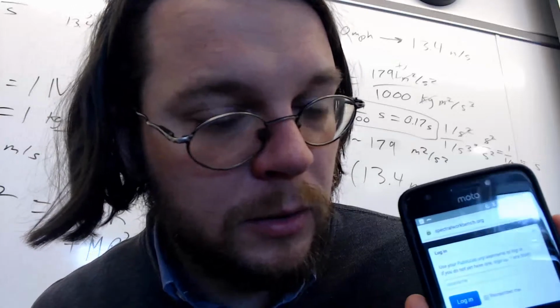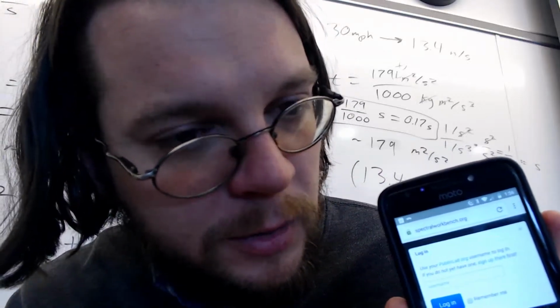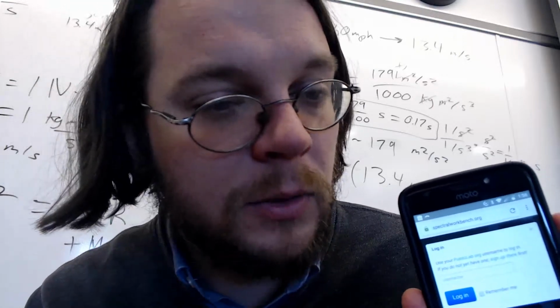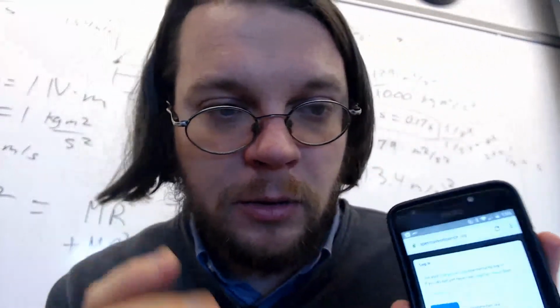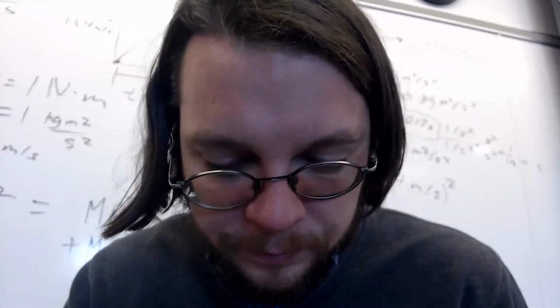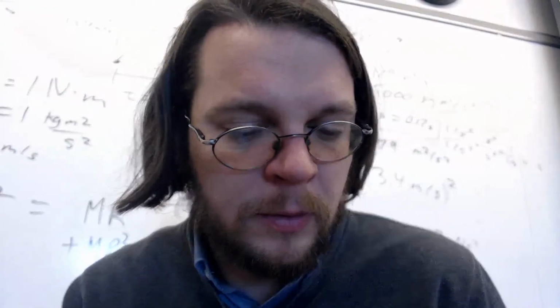So I'm going to go ahead and put in my username. Now the weird thing is that when you put your username in, you press login, it doesn't actually log you in. Instead, it goes to a page where you can actually put your password in. But in any case, I'm going to go ahead and do that. So there we go. Click login.